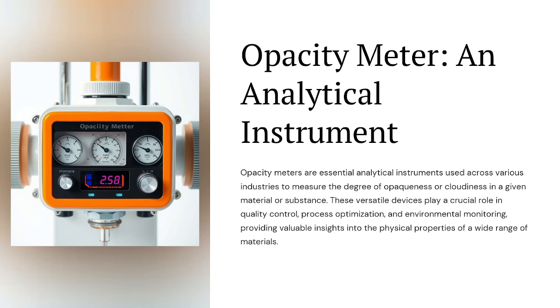Today I am going to present an analytical instrument, the opacity meter. This instrument plays an essential role in many industries, from monitoring environmental emissions to ensuring the quality of products. In the next 15 minutes, I will explain how it works, what it is made up of, and why it's so important. Let's get started.